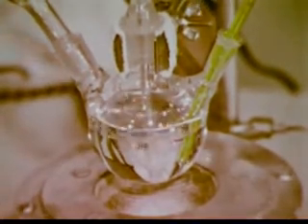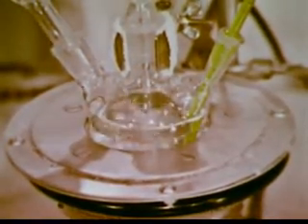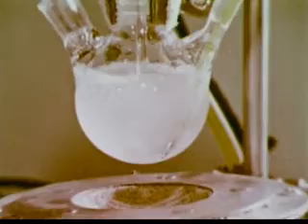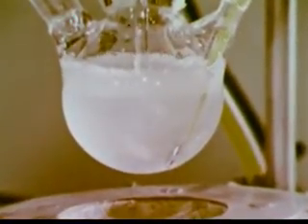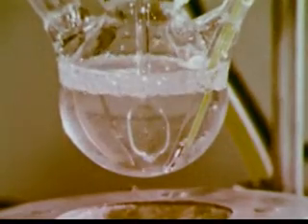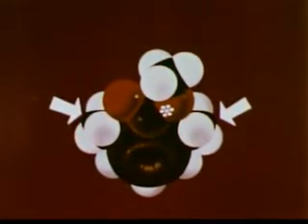We'll test this idea by heating the new ester, methyl 2,6-dimethylbenzoate, in the presence of aqueous sodium hydroxide, repeating the original conditions. After stirring and heating for 8 hours, no detectable reaction has occurred. There are still 2 layers. This experiment also fits our proposed mechanism. Since no other suggested mechanism fits all our observations, we assume the proposed mechanism is the true one. Seemingly, these bulky methyl groups have greatly hindered the reaction.